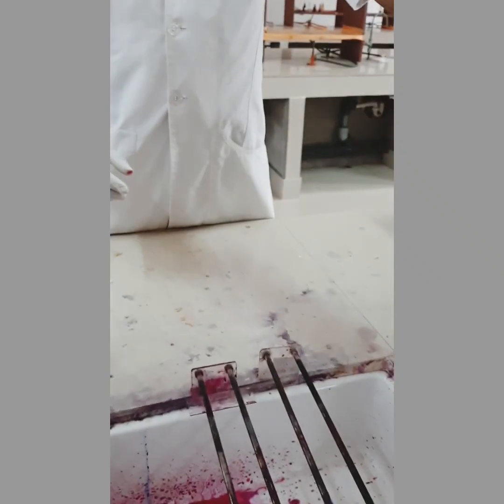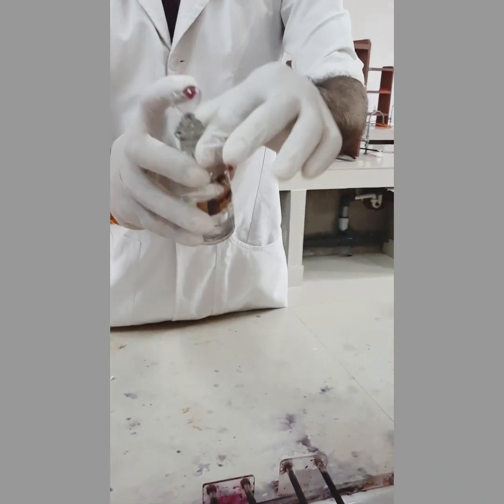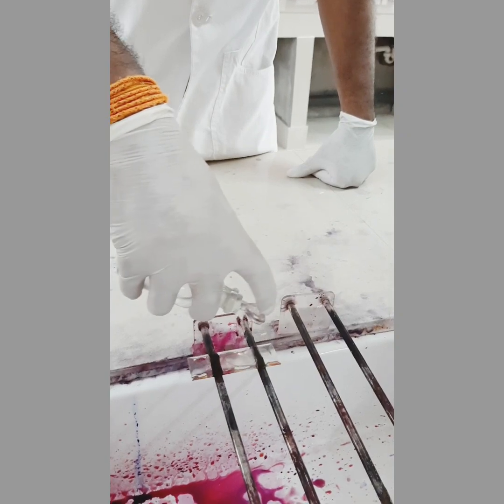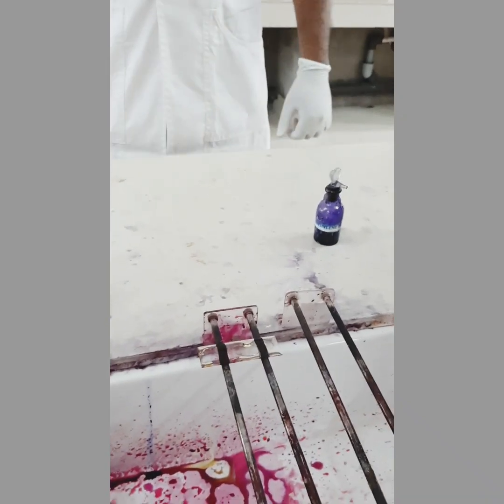Decolorize with 20% H2SO4. You should be careful. It should be poured over the slide. Keep it for 3 minutes. You have to wait for 3 minutes.